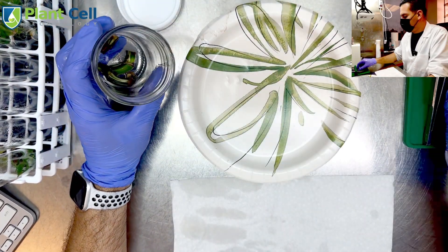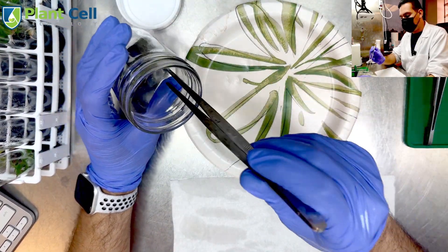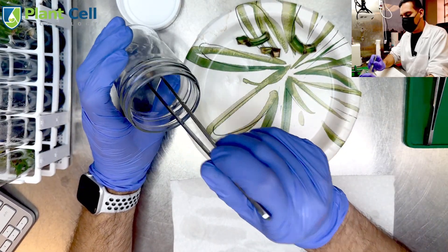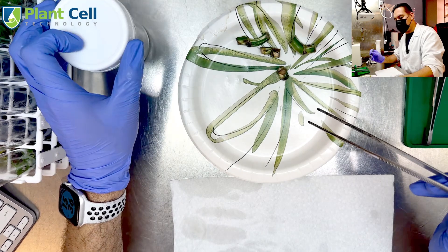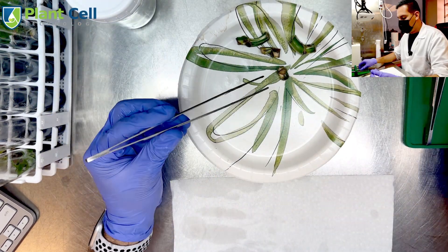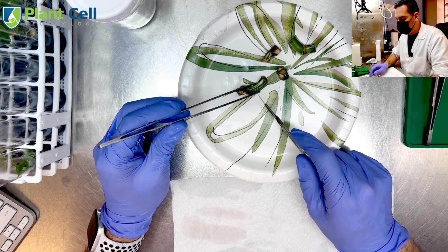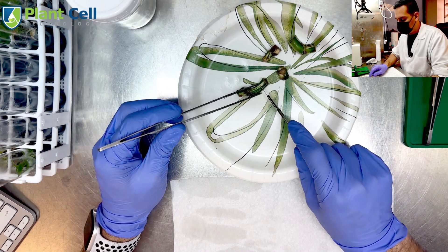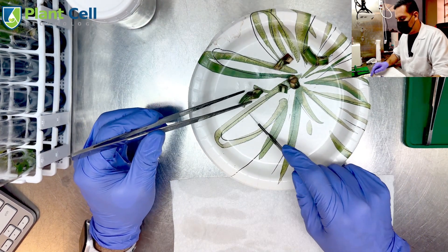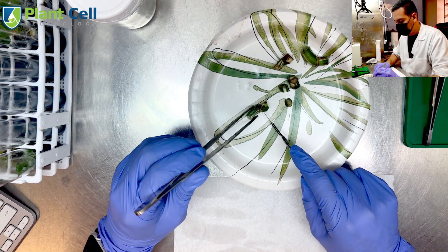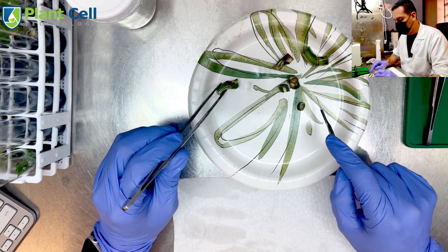Open the jar, take my forceps, take the cuttings out of the jar. Take my blade and I'm going to cut them. I don't need them to be this long, so I'm just going to cut this one on this side. The other one I also want to cut, and this one is good to go.